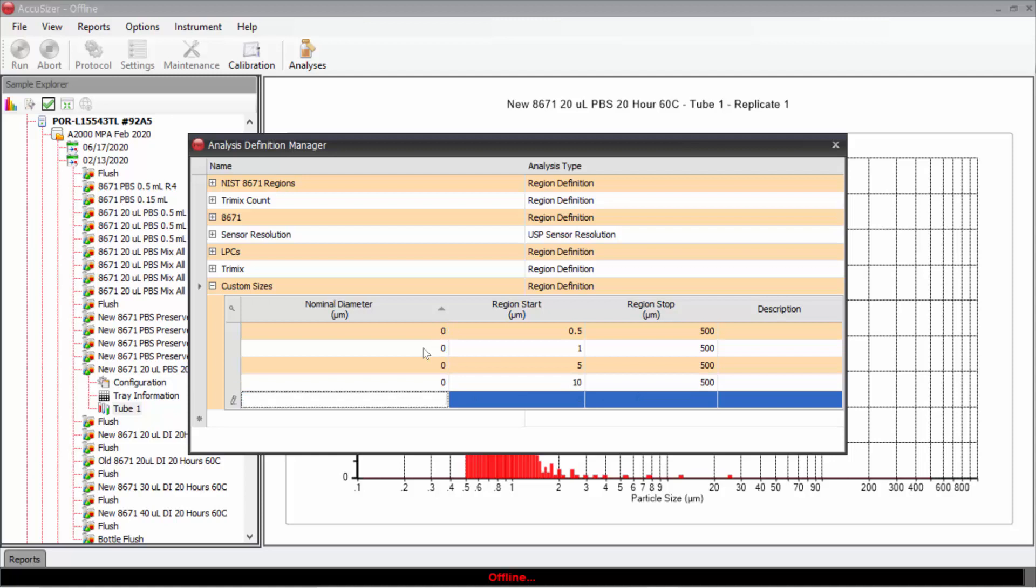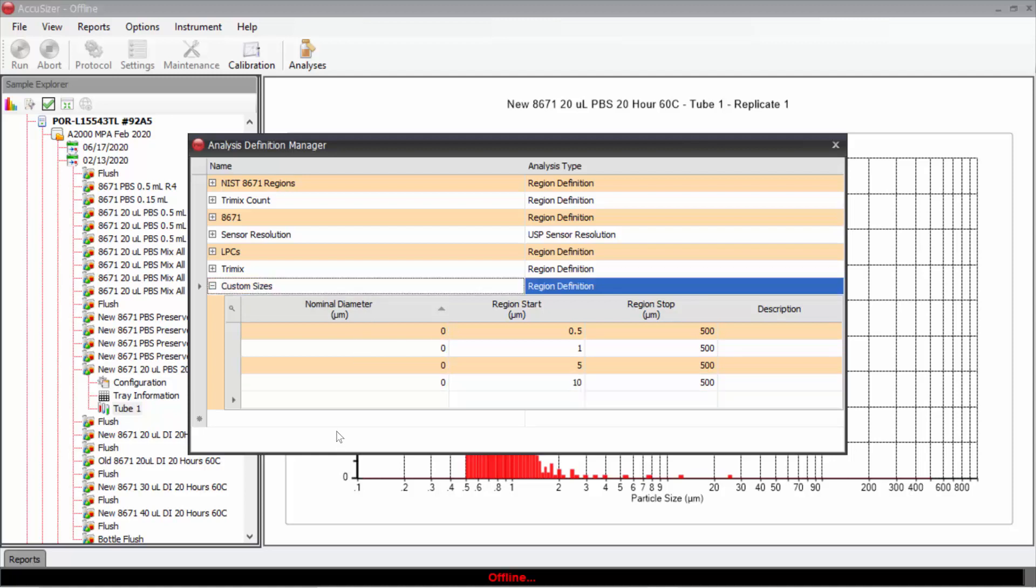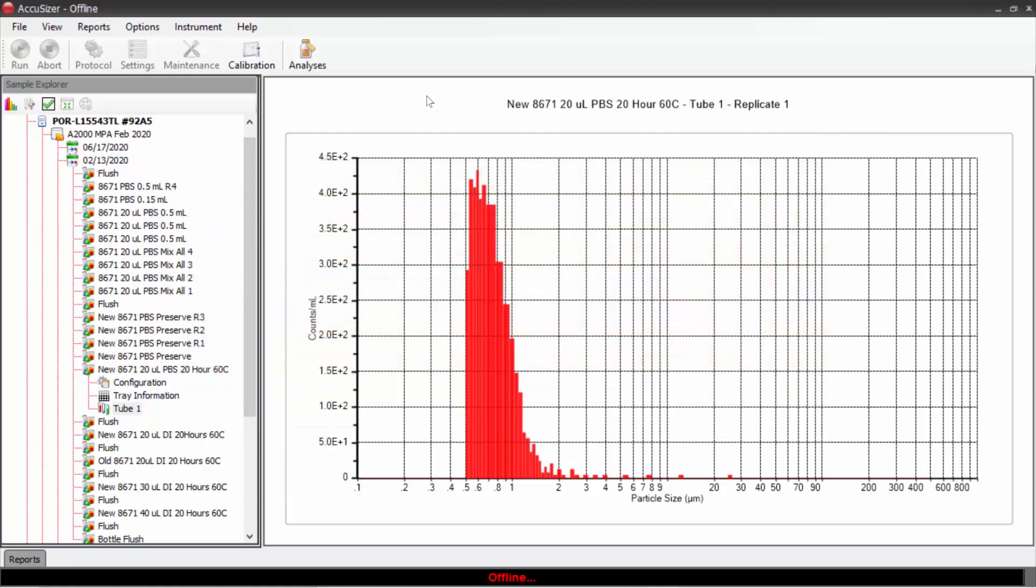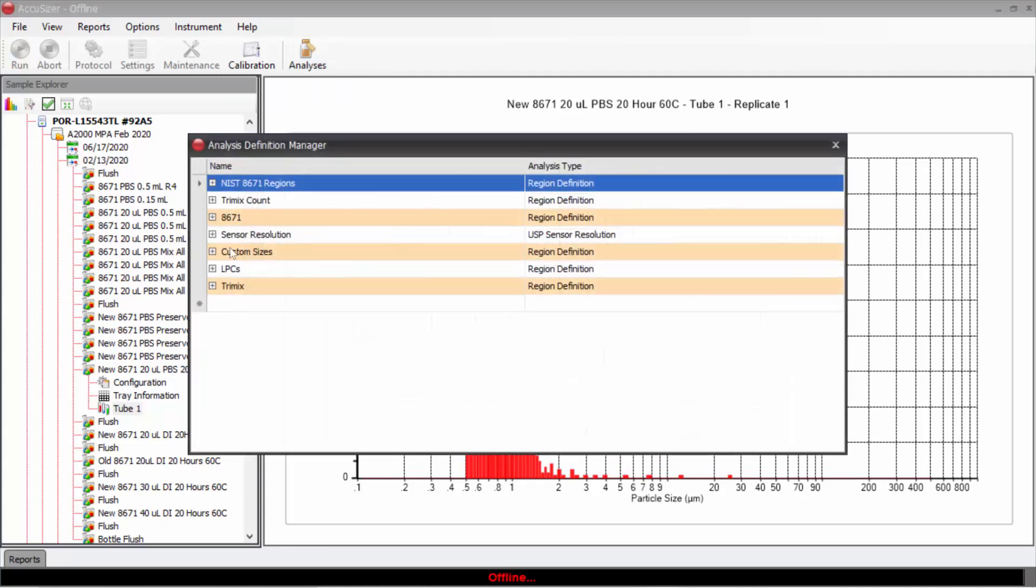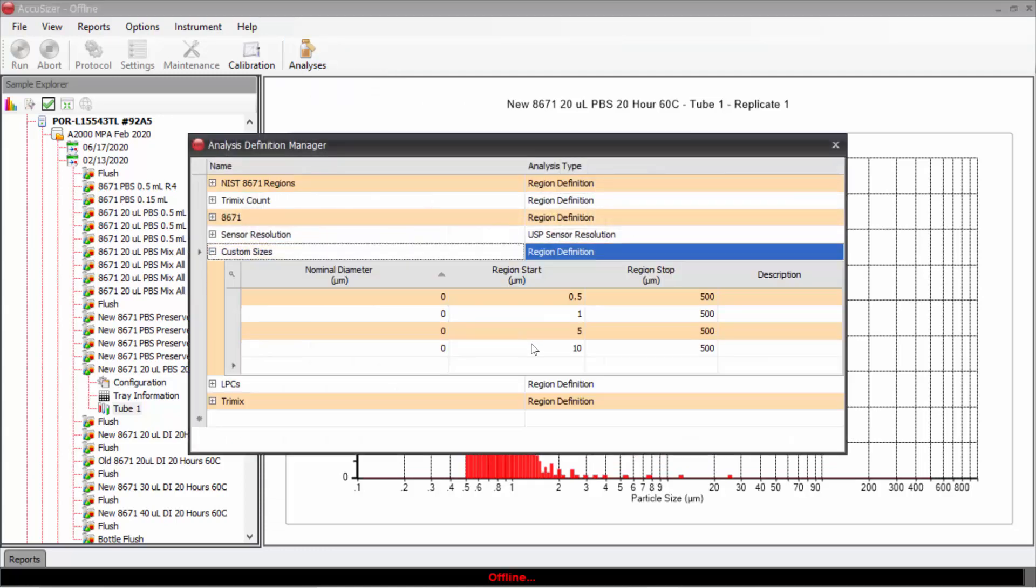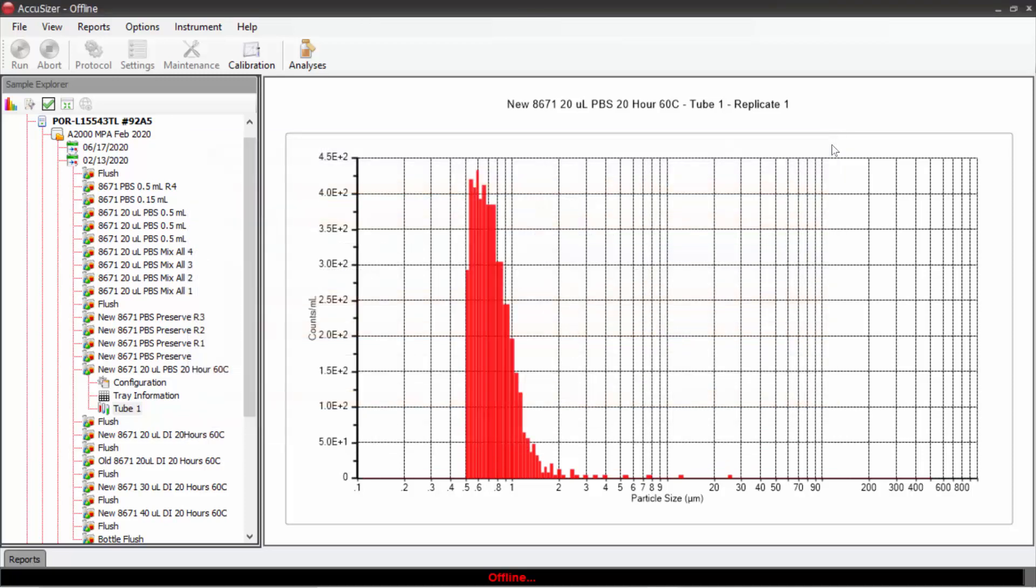Okay, we have now defined these custom sizes. We don't have to click save. When we close this and we open analyses again, we'll see custom sizes is chosen here. And now if I want to, I could create a report where we will report information in these chosen size ranges.